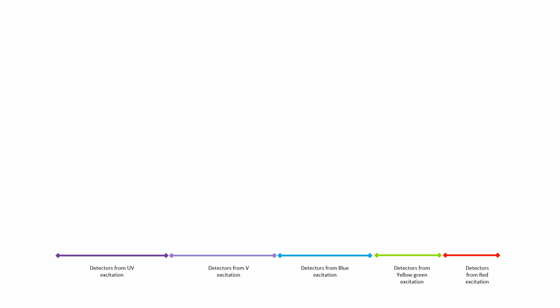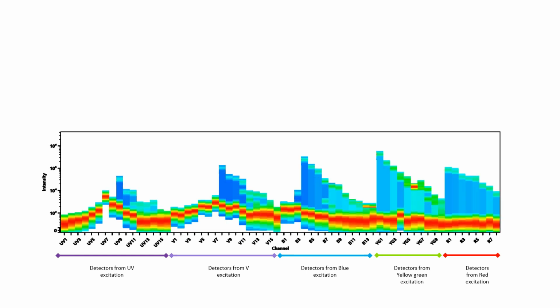Spectral cytometry has rapidly become more mainstream, and, as you probably know, this technique uses multiple detectors that span a wide range of emitted light in order to generate a spectrum of emission after excitation of the particle by the onboard lasers. A multicolour sample, such as this, will contain many different spectrums and the background emission that incorporates the particle autofluorescence plus the signal of the instrument noise.